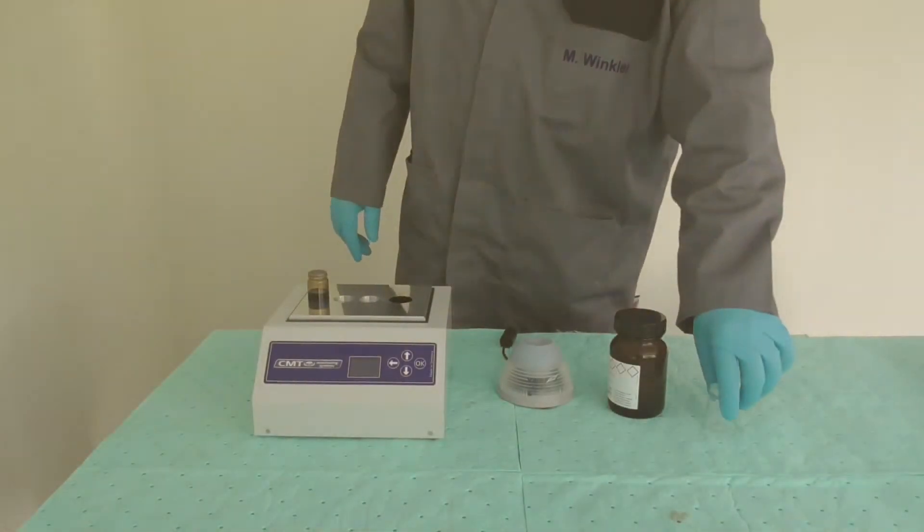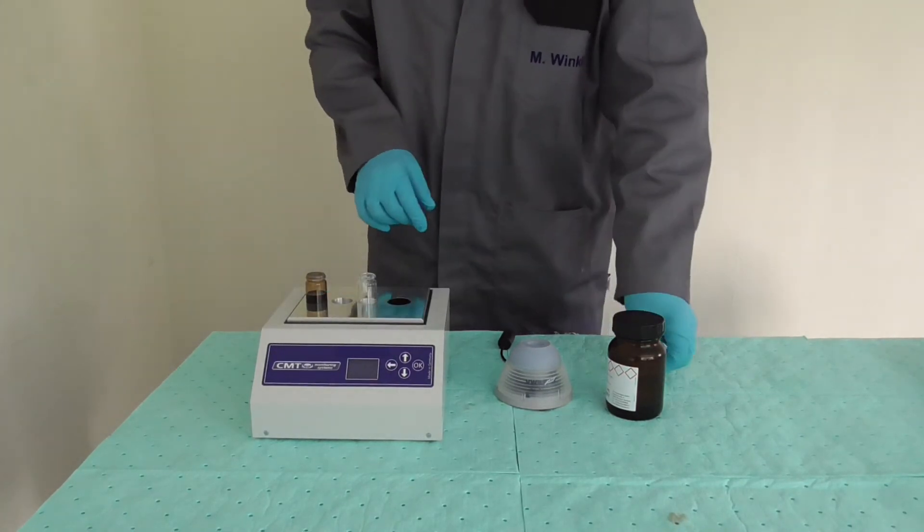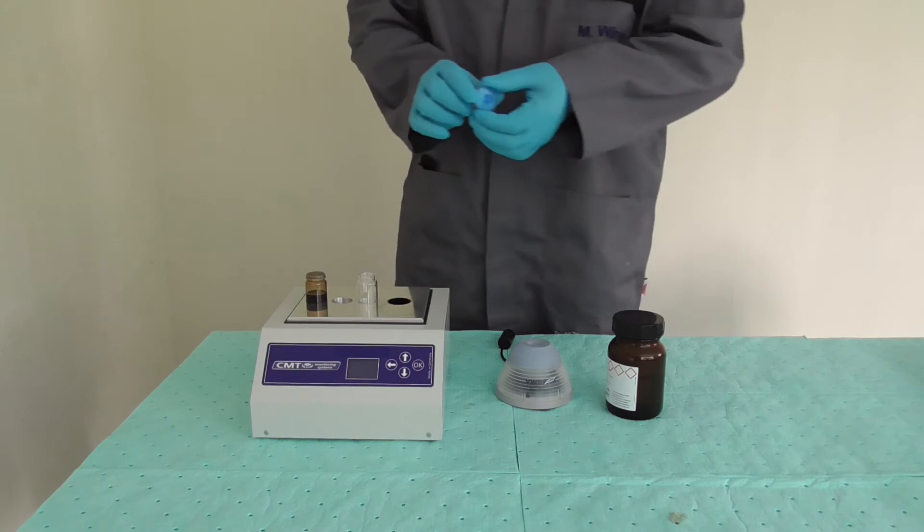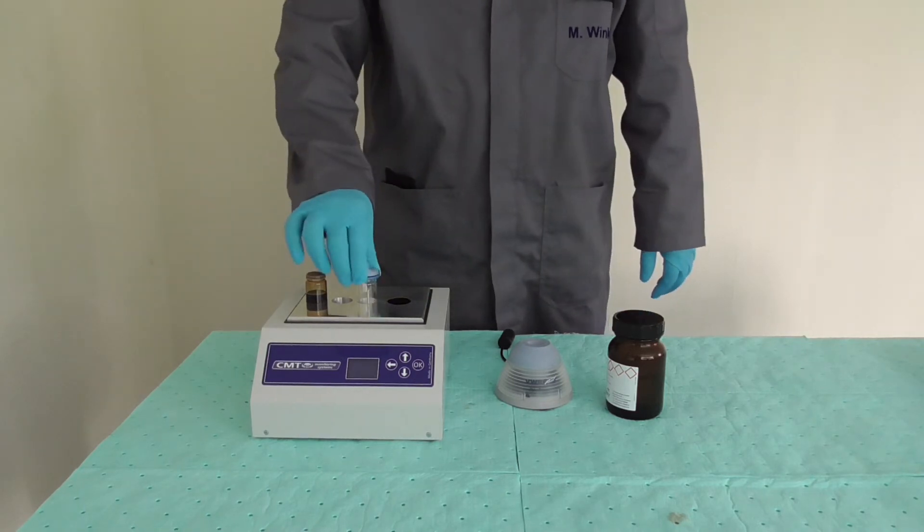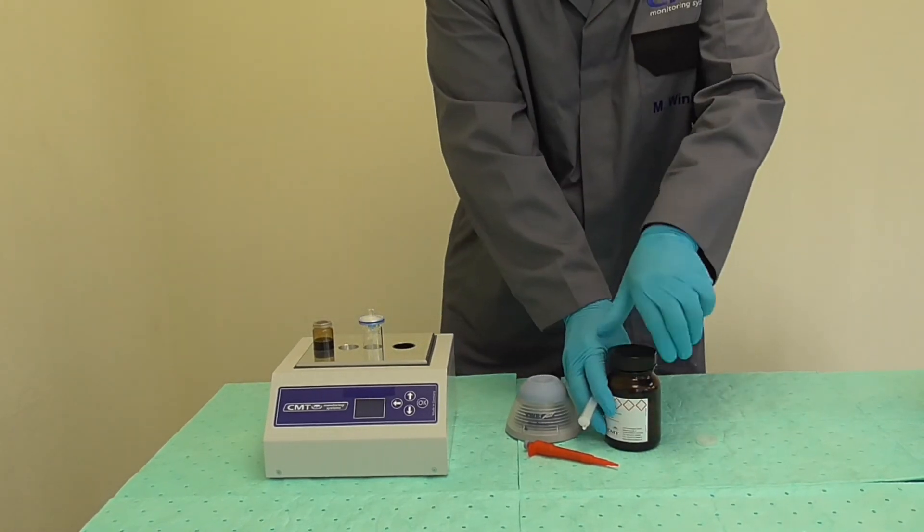Take a second clean vial, uncap it, and place it in one of the three vial holders on top of the device. Place a blue filter on the second vial. The filter needs to remain on the vial during the entire test. Please make sure the white side of the filter is facing you.